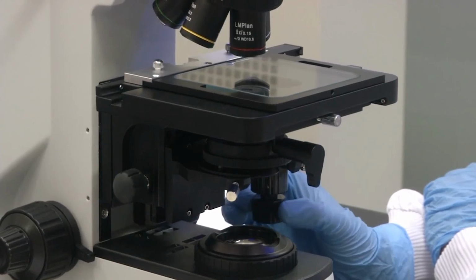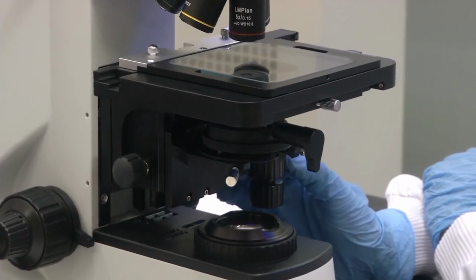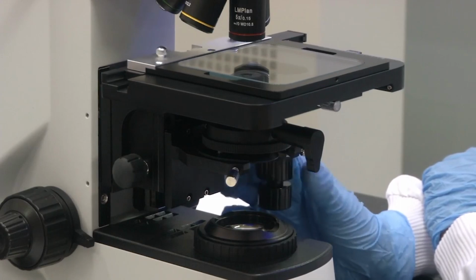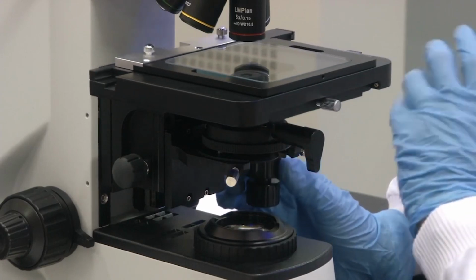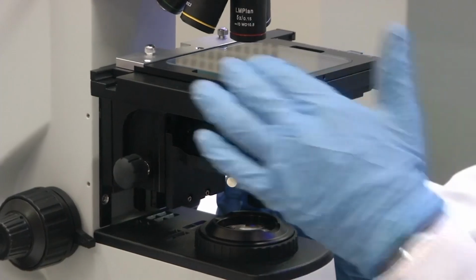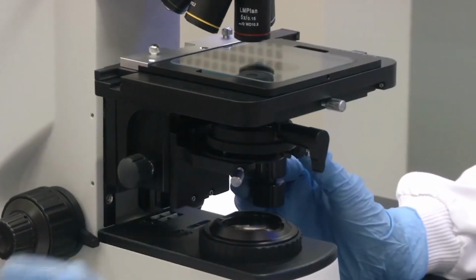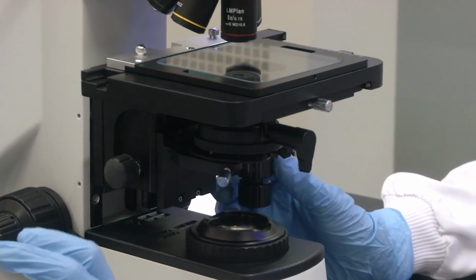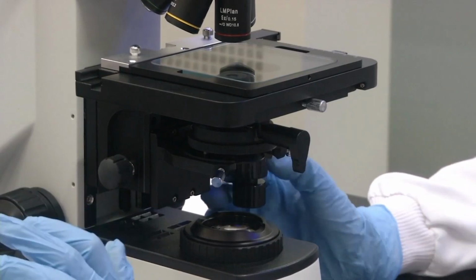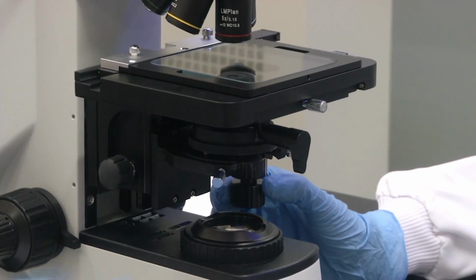Now I am adjusting the x values. The stage is moving in the x direction, and I am adjusting the y value now, and it is moving in the y direction. The illumination will be provided from bottom or top. So you cannot put your sample in the entire sample holder, because only one particular part of the sample will come under the view of your objective or eyepiece. For that matter, it is essential that you be given the option to move your sample around. That is how this x y staging or movement becomes useful.